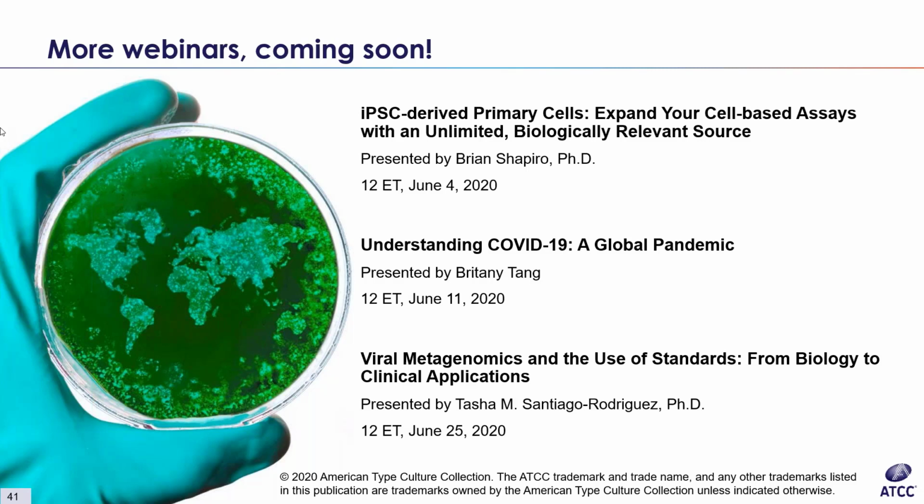Okay, so the first question was about where you can get the protocol? Yep. This is for the in vivo model, so injecting into the animal. The general protocol for the injection process is on the website on the individual page, and it refers back to the Perkin-Elmer protocol, because they're the ones whose instrumentation you use for the imaging. So they have protocols that we recommend for that.